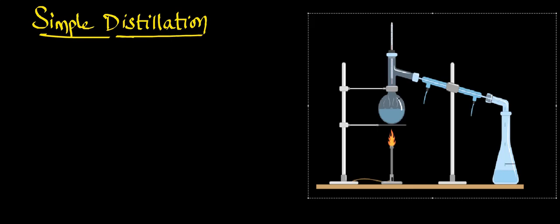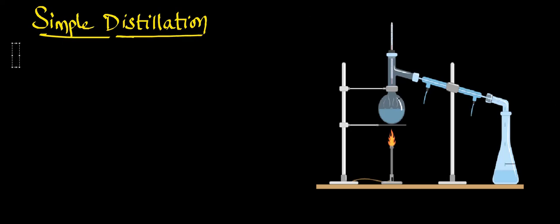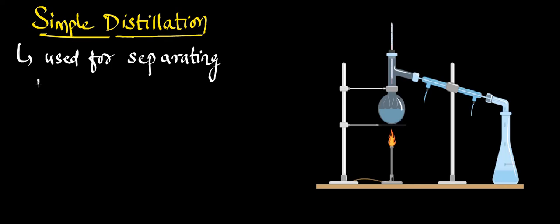Today we will study about simple distillation process. So this is a technique which is used for separating the miscible liquids. Miscible liquids means which mix uniformly with each other.